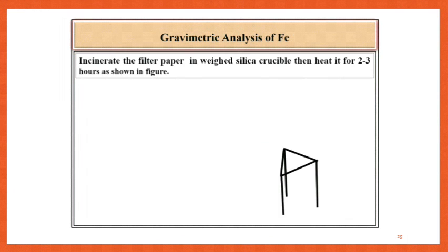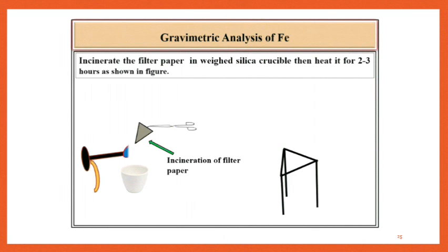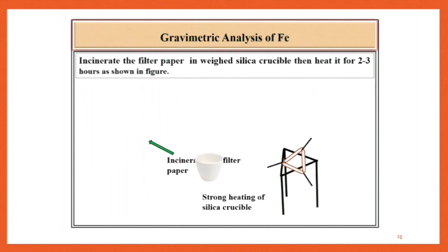The next step is incineration of filter paper. The procedure is: take previously weighed crucible and fold the filter paper as shown in the video and heat it strongly on blue flame. Then transfer it in a crucible and heat this crucible on a blue flame strongly for 2 to 3 hours.